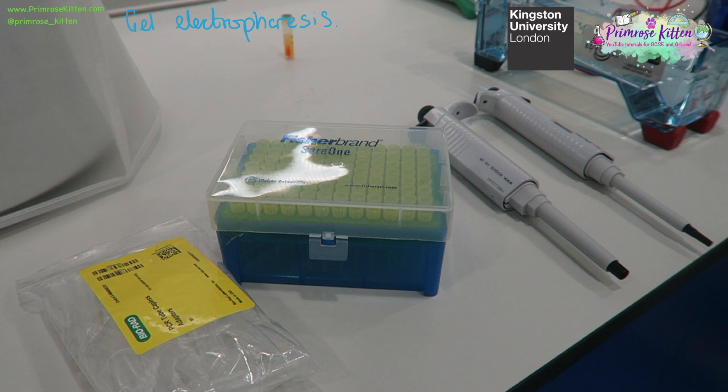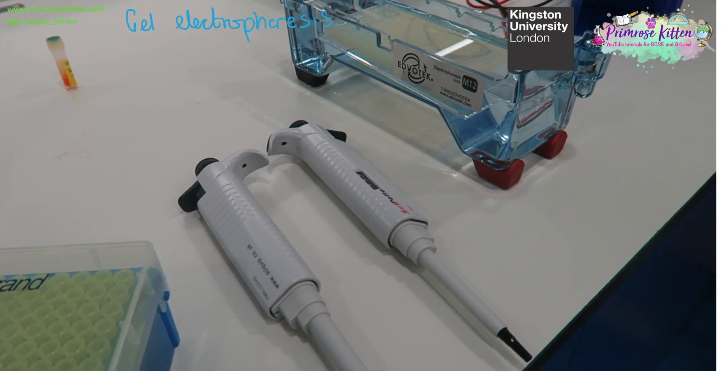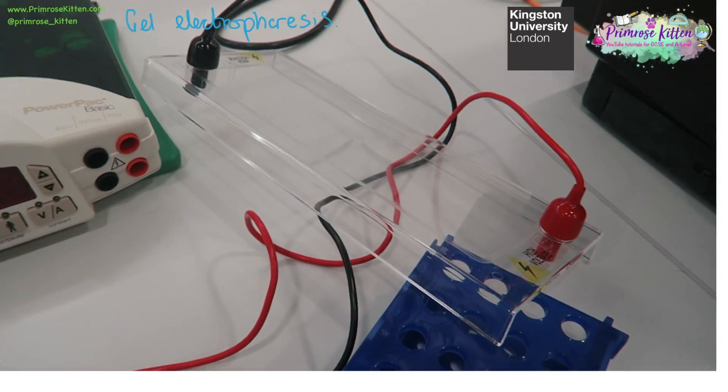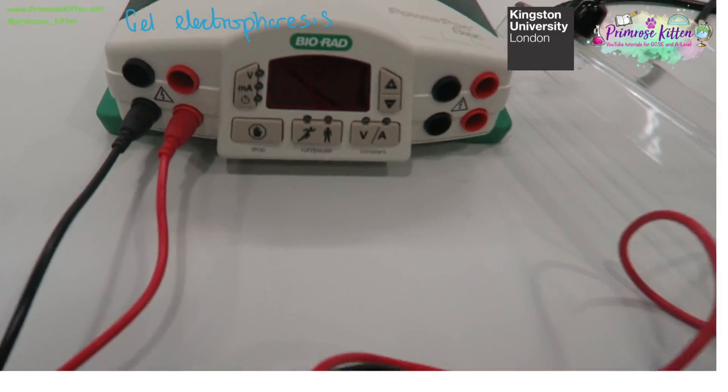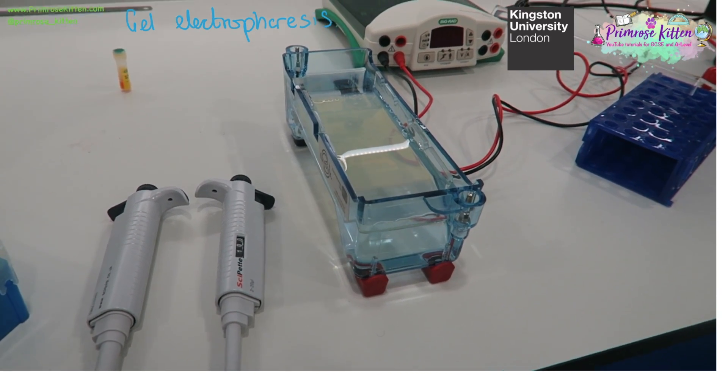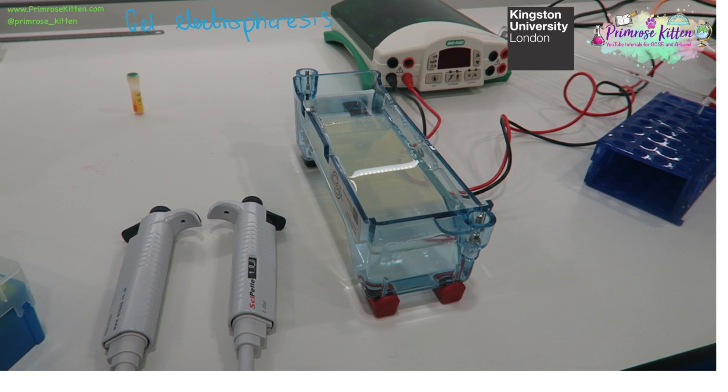When you have enough DNA, either by PCR or by cutting with restriction endonucleases, you can run it on a gel in a gel electrophoresis. Here I was lucky enough to go to the University of Kingston to use their equipment. We have pipettes and a gel tank, where we're going to be putting DNA into the wells. This is connected to a lid, which is connected to a power pack, allowing us to run a current through the gel so the DNA moves through the agarose gel.